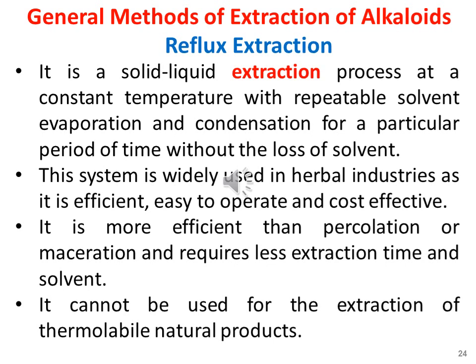Reflux extraction is basically a solid-liquid extraction process at a constant temperature with repeated solvent evaporation and condensation for a particular period of time without the loss of solvent. This system is widely used in herbal industries as it is efficient, easy to operate and cost effective. It is more efficient than percolation and maceration and requires less extraction time and solvent. However, it has the disadvantage that it cannot be used for the extraction of thermolabile natural products.